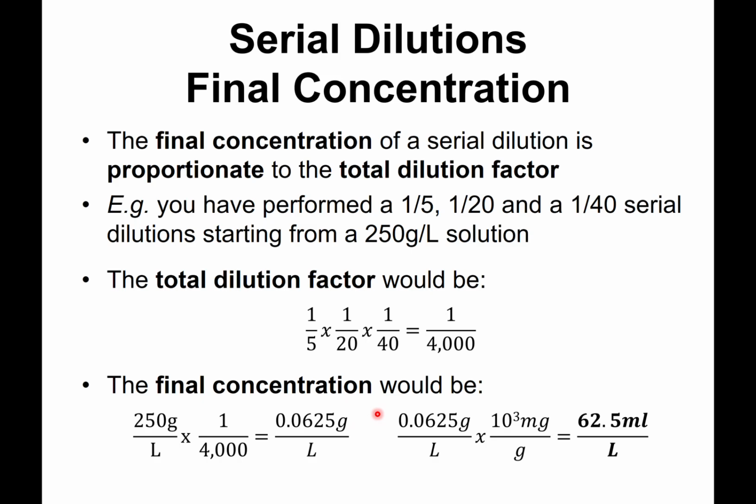Now, when it comes to final concentration and so on, sorry, there is a mistake here, I just noticed it. It's always good to write it down with the smallest number of digits possible, right? So in this case here, there are already quite a few digits.